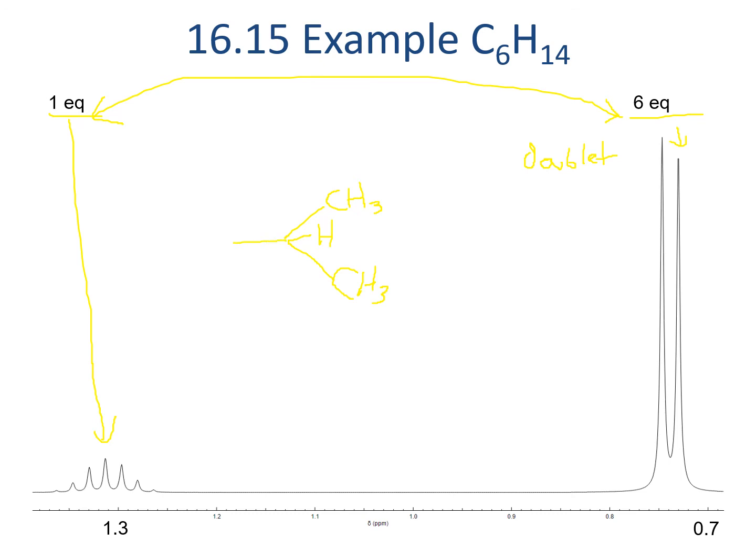And so the other molecule would have to be completely symmetric. Notice that we have these 2 hydrogens right here and right here that are giving us those heptets. They don't actually split each other because they are identical, in the same way that none of the hydrogens on this carbon split each other either. So this molecule is the source of this structure.